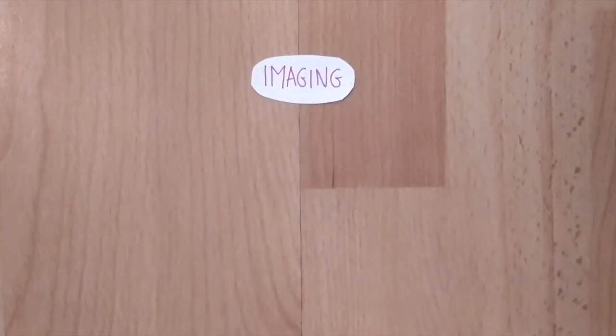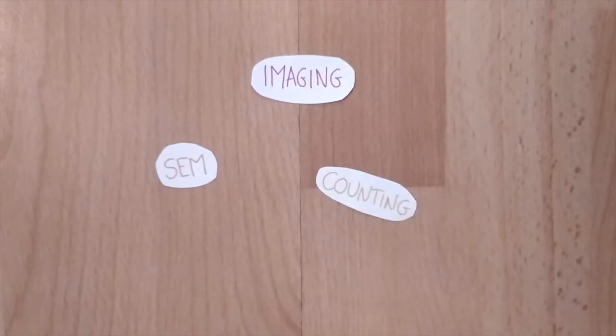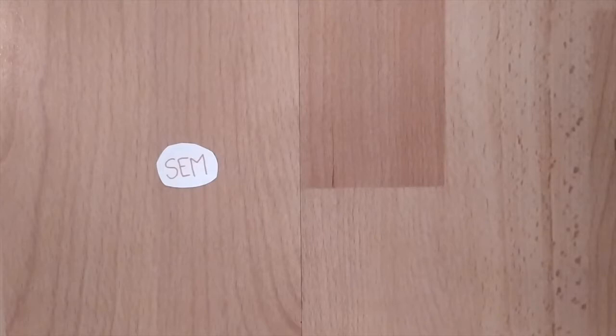Enough talking about neuroanatomy now. Let's talk about the most interesting part, imaging. I will divide this part into two segments, with first a presentation of SEM imaging and then how it could be useful in our case to count synapses. Let's begin with SEM then.